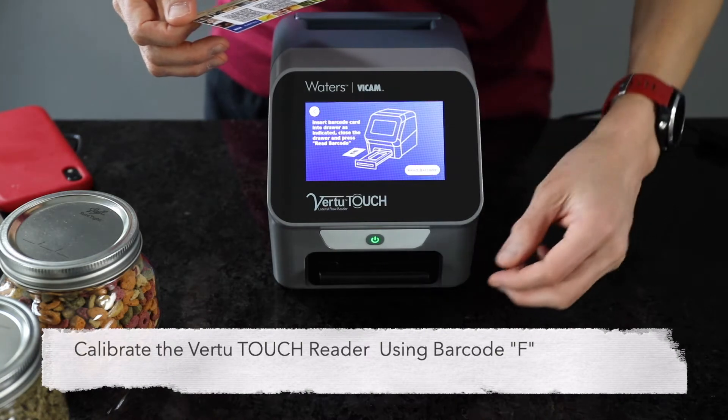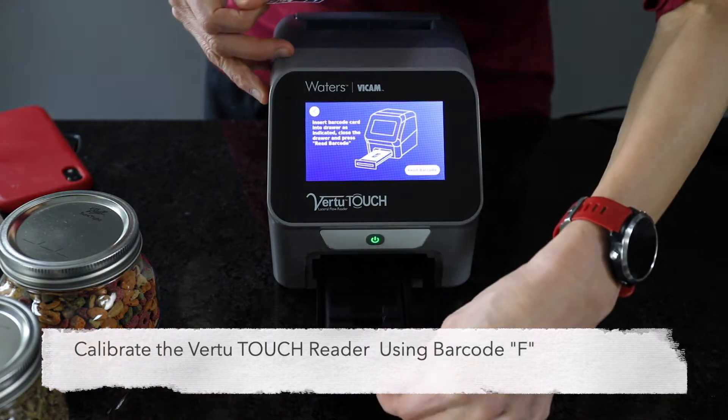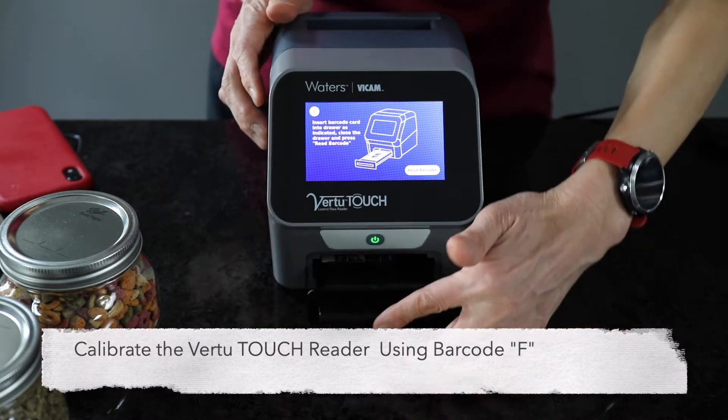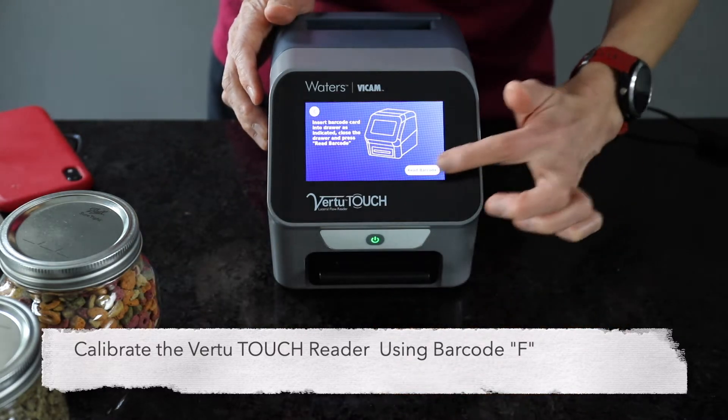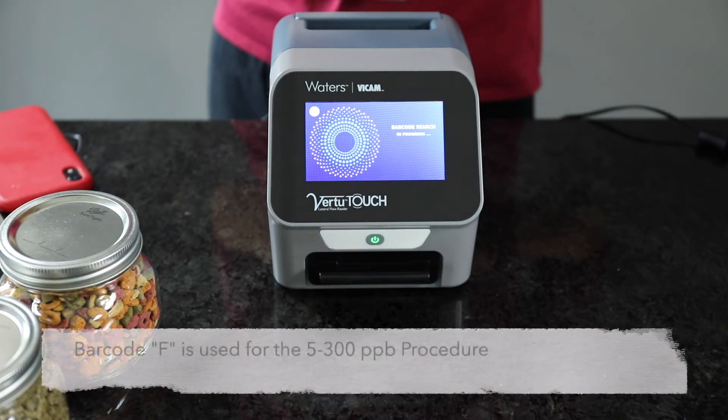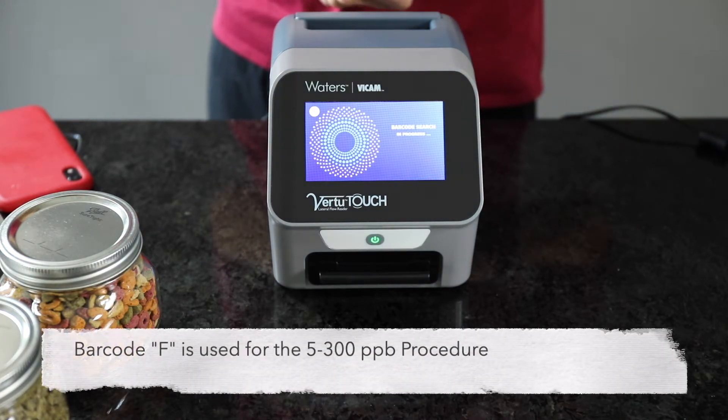Start by calibrating the Virtu Touch Reader using the barcode supplied with the Afla V1 kit. Two detection levels are available using Afla V1, each with a unique barcode. For this method, we'll enter barcode F.